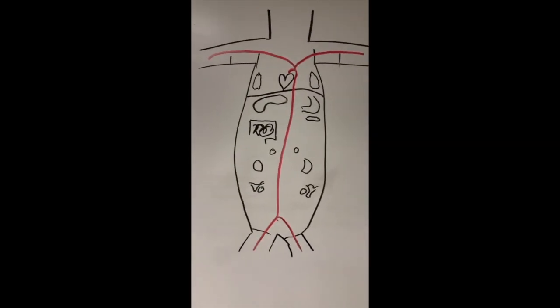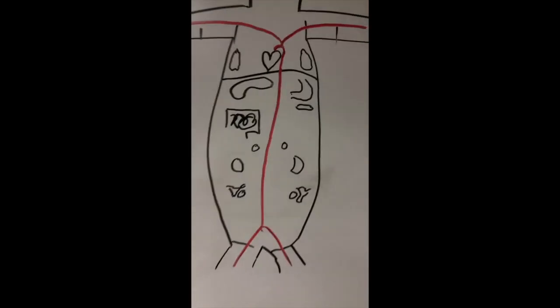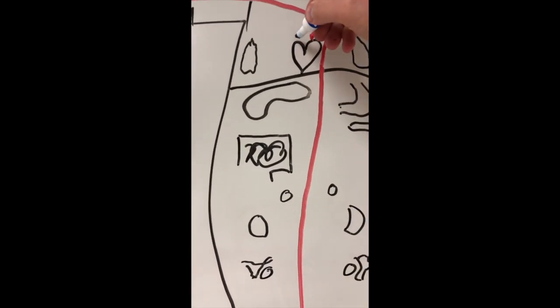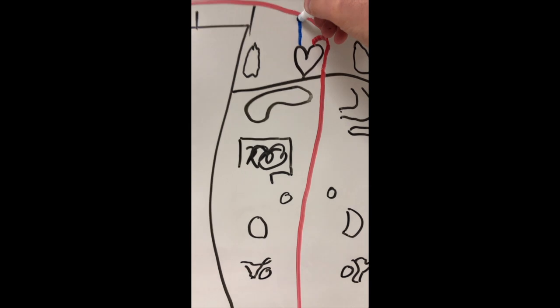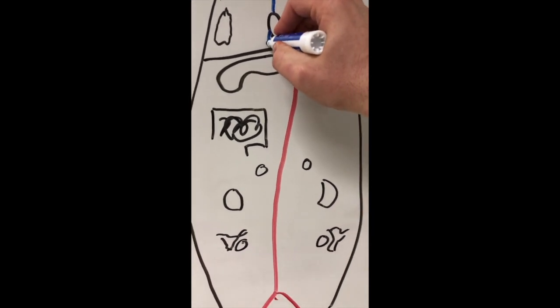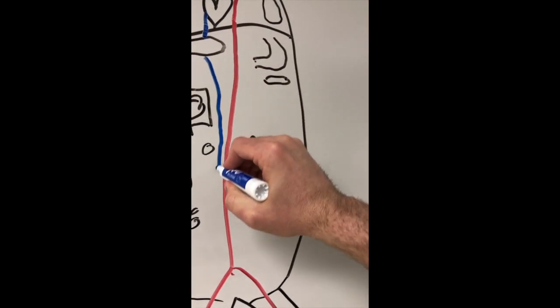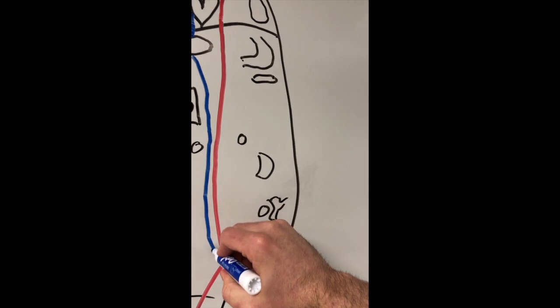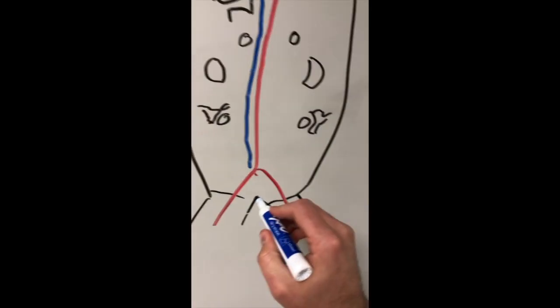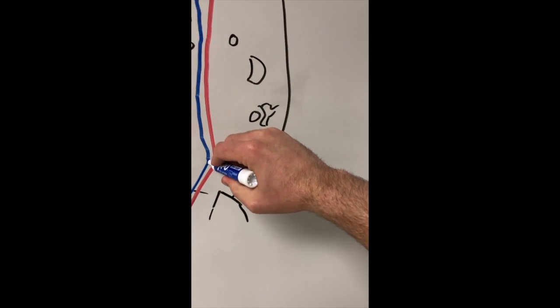So obviously if blood supply goes out, it also needs to come back. So we'll go ahead and include a superior vena cava right there, and we'll include an inferior vena cava. So the inferior vena cava passes through the diaphragm, through the liver, and then down, tracks the aorta most of the rest of the way down the body. And obviously drains the lower appendages as well.